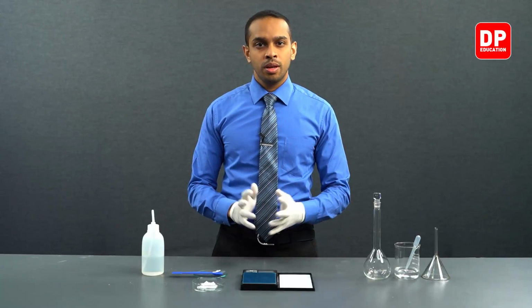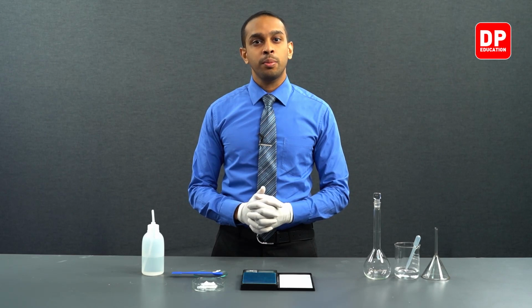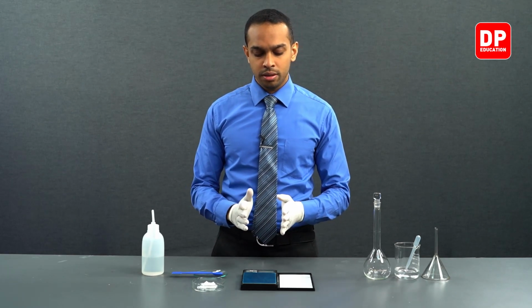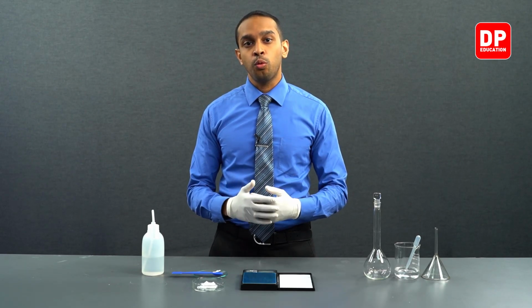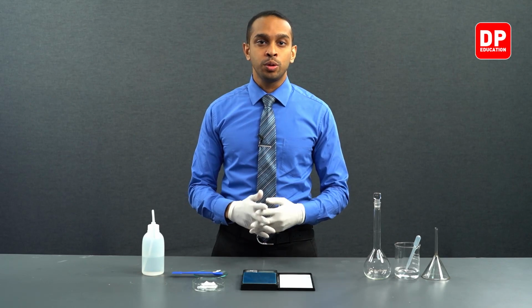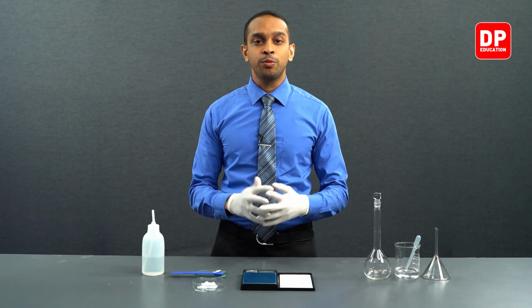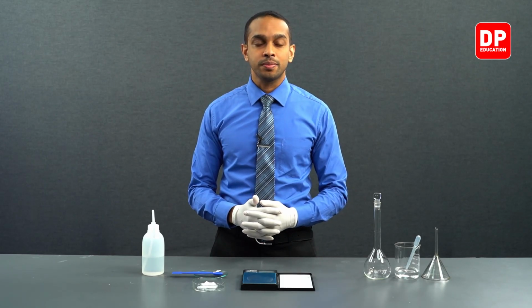Now, let's start weighing potassium oxalate. But before we get on with it, I would like to let you know why we have to titrate a potassium permanganate solution before we use it in other titrations.